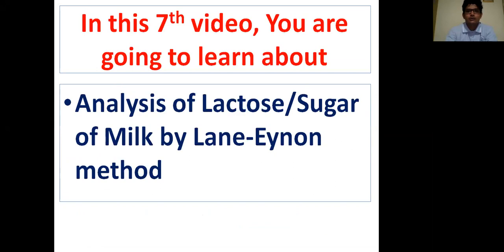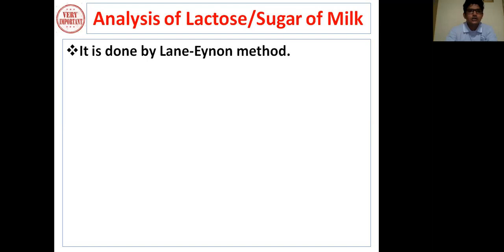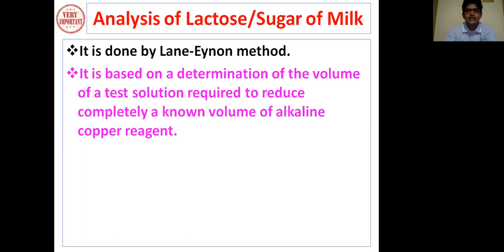In this video, we are going to see the analysis of lactose sugar present in milk using the Lane-Eynon Method. Here is the analysis of lactose or sugar of milk. We are going to discuss the detailed procedure for analysis of lactose or sugar present in milk. It is done by Lane-Eynon Method.